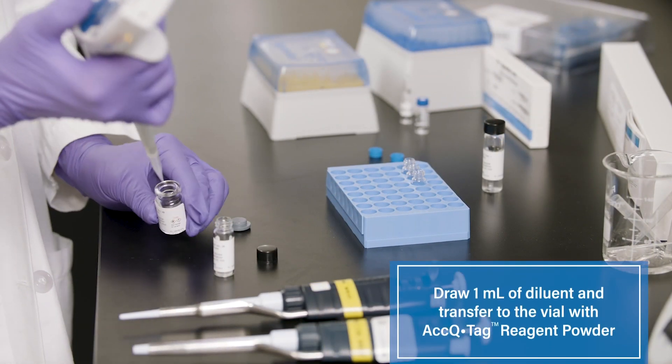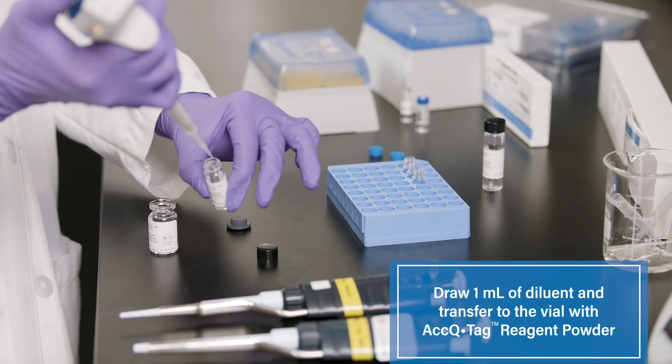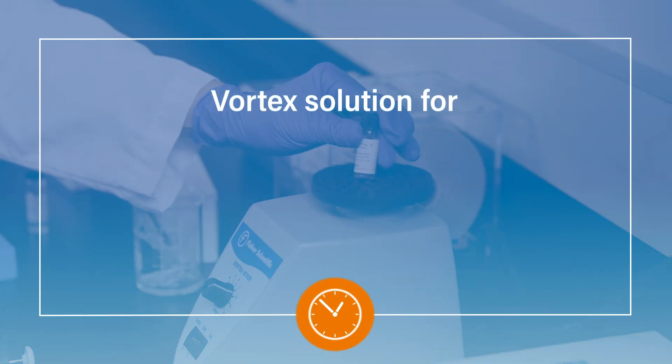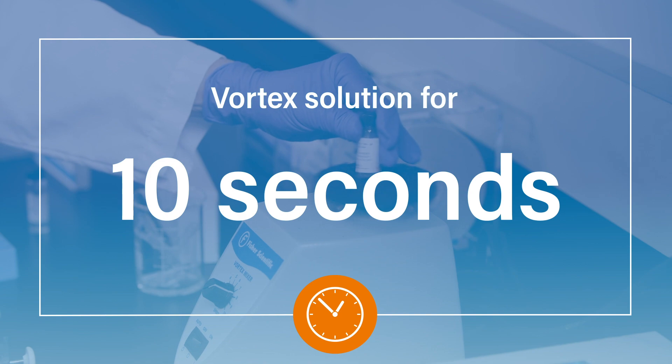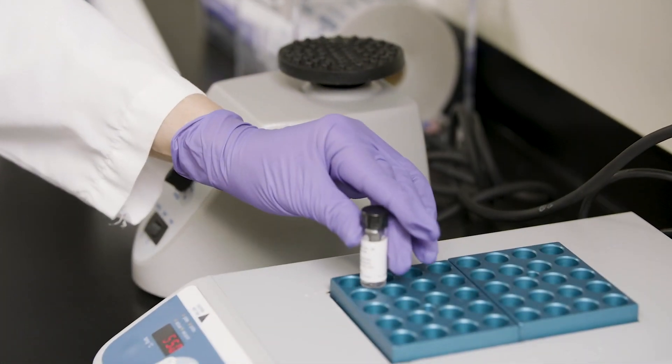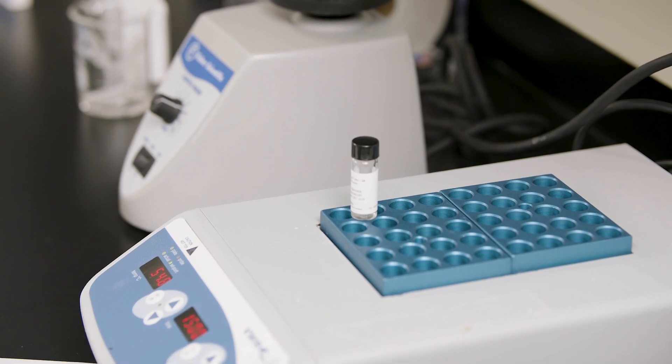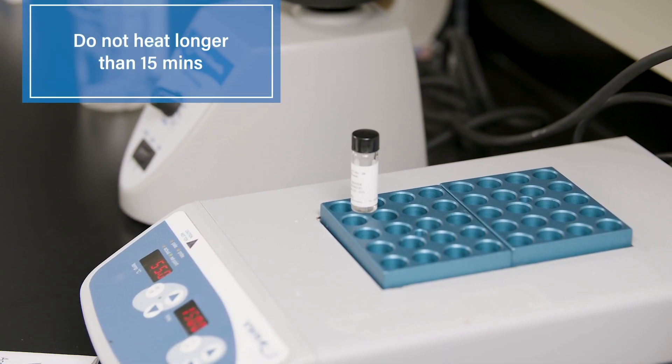Draw 1 milliliter of diluent and transfer to the vial with the AccuTag Reagent Powder. Now vortex for 10 seconds. Heat on top of the heating block and vortex occasionally until the powder dissolves. Do not heat longer than 15 minutes.